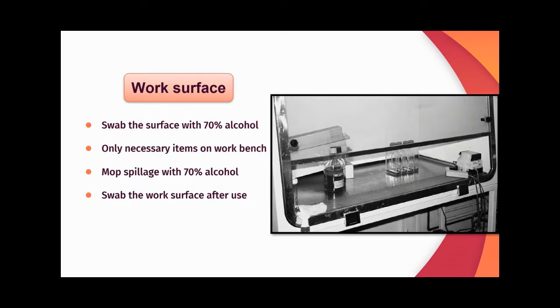For the work surface, swab the surface with 70% alcohol and only necessary items should be brought onto the surface. Mop up any spillage and swab the area with 70% alcohol. Swab the surface after use as well.